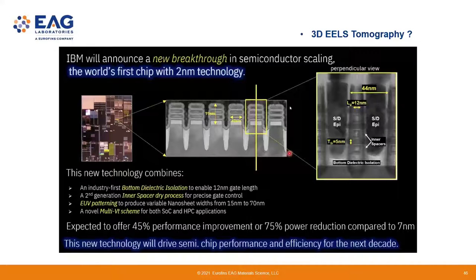Yes. So for semiconductor devices, as I mentioned at the beginning of this presentation, I have never been able to do atomic resolution EELS for a silicon device, right? Because in the neighborhood of the silicon you've got dielectric materials, both high-K and low-K materials surrounding the silicon. You can probably get close to maybe 5 or 6 angstrom of EELS resolution, but going really to atomic resolution is a great challenge. I hope some of the audience from academia can help to answer this type of question: what is really the fundamental limit of the EELS technique for this type of nanoengineered samples? You can do this on ceramics, but it's not relevant to the semiconductor industry most of the time.